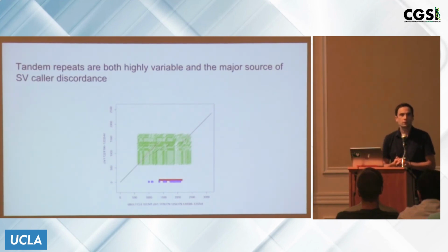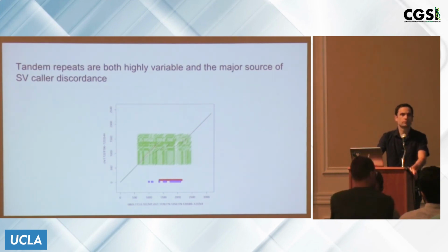Especially tandem ones. Say the zinc finger proteins scenario is easier, or VDJ sequencing is a little easier in the germline, just because there's a gap between successive V segments, and you can correct the errors in between pretty accurately. As long as there's a little hook, a little anchor that you can correct pretty accurately, you can do something like that. Right, yeah. Sometimes it can be misleading to have summary statistics on all sequences.